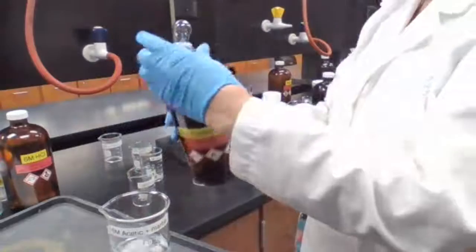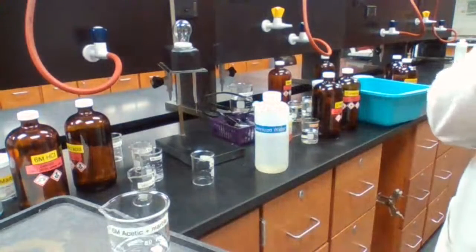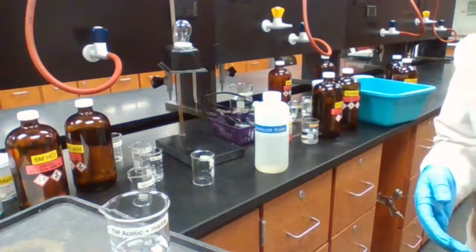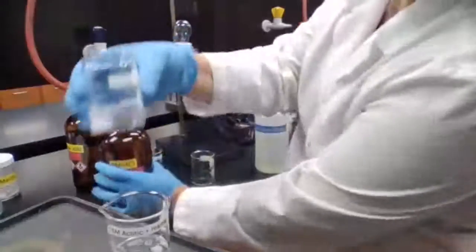What happens if we add acetic acid to marble? And what happens if I add HCl to marble?